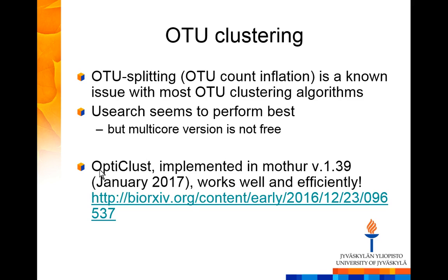Because if you have lots of data, this OTU clustering is what will stop you. It requires lots of memory, lots of cores, lots of time in any case. So this clustering algorithm, I definitely recommend to test it out. It seems to be working well. And check out the publication. In the publication, they say that it works as well as or better than USearch. So it's cool that we have the course now and not last autumn when we didn't have this yet.